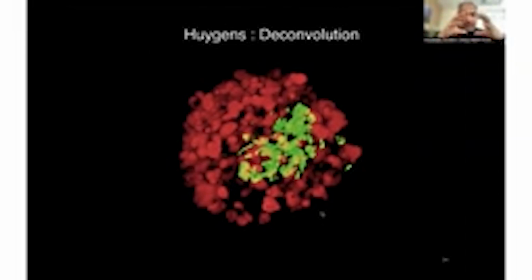And this is a confocal image. So we've taken sections and then we have deconvoluted it using such an algorithm to get this clarity in the architecture in a way that we would not have had otherwise. So we can do stuff like this in this system in a way that would not be possible otherwise. So that's where I will stop.